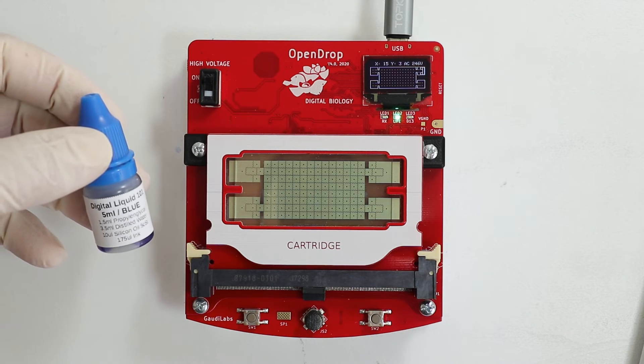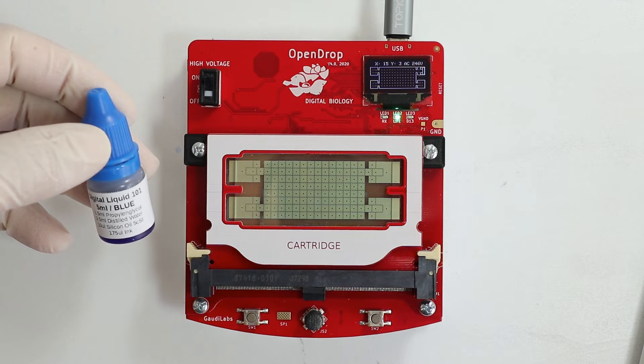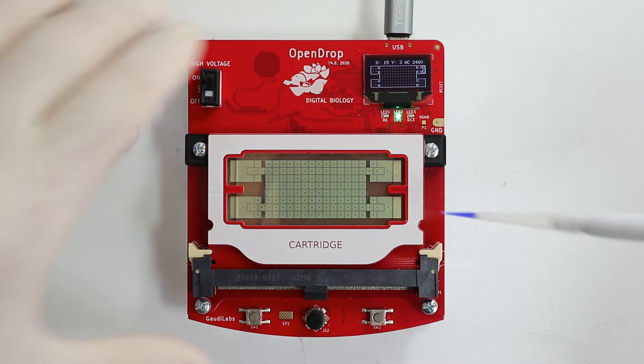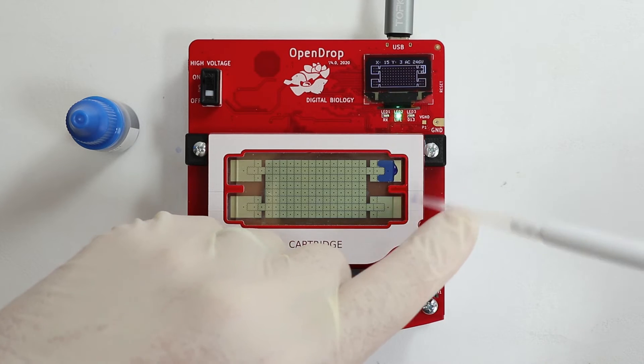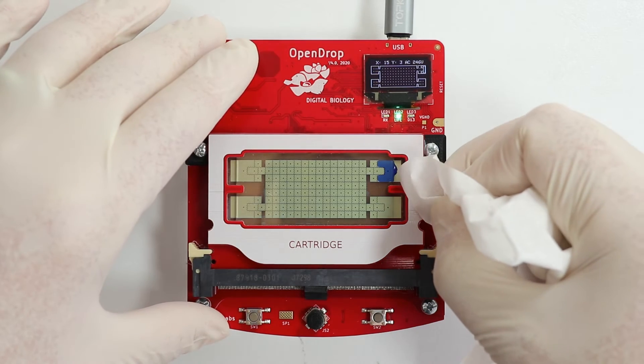For first experiments, best use the Digital Liquid 101, a specially surface tension adapted liquid for the OpenDrop. Using a micro pipette, pipette 12 microlitre of digital liquid from the side of the glass into the reservoir. Remove any excess liquid from the side of the glass.